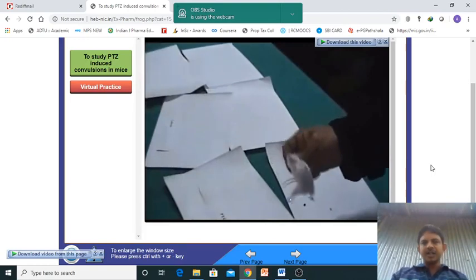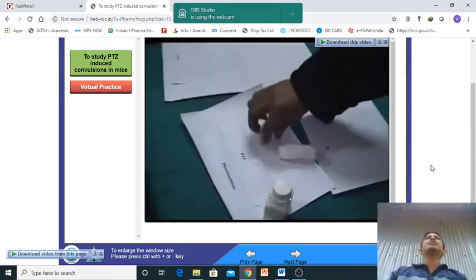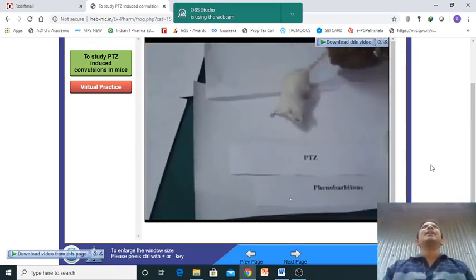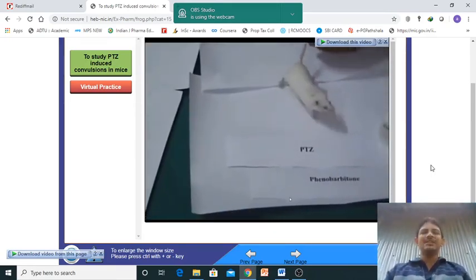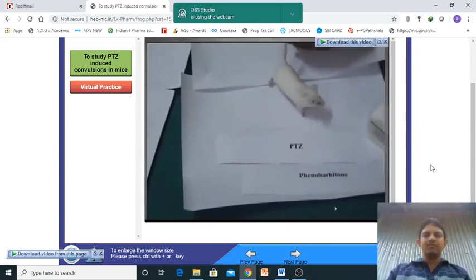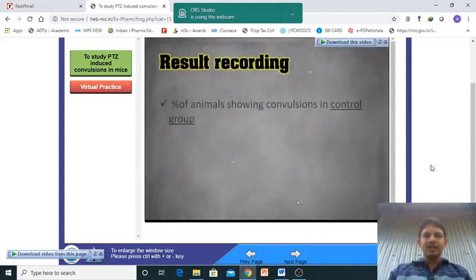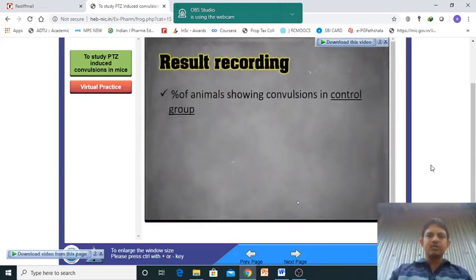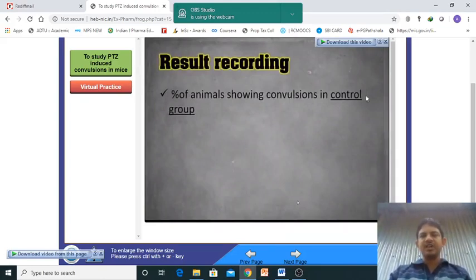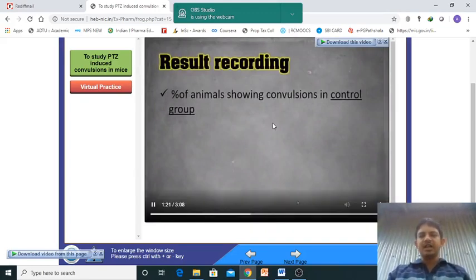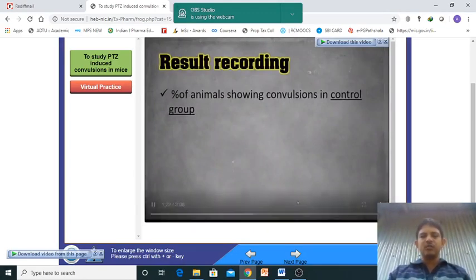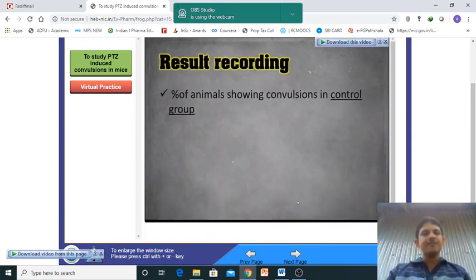Benzodiazepine acts on the GABA receptor by opening it. Phenobarbitone — a barbiturate — has also been given. We are showing convulsions in the control group and will also check convulsions in the animals treated with the drug class.